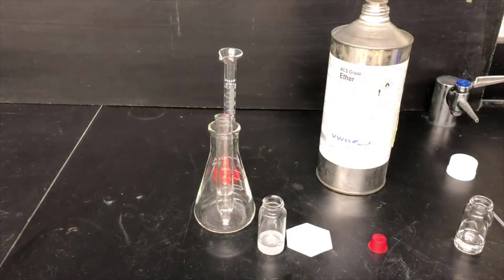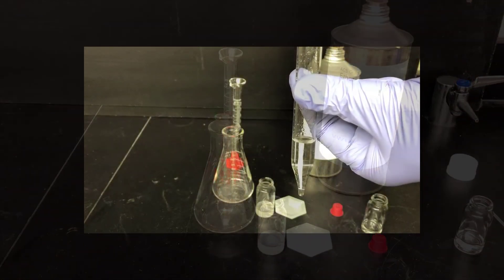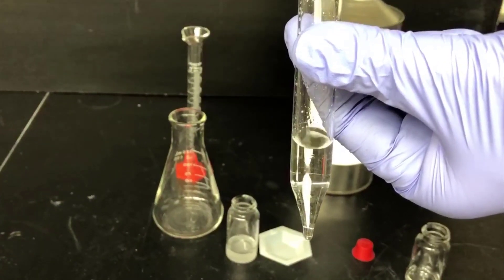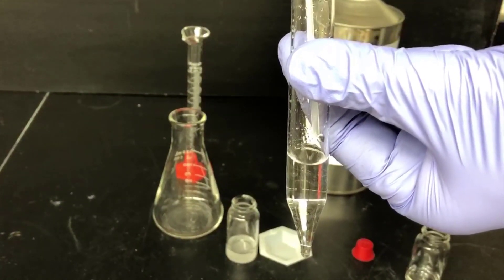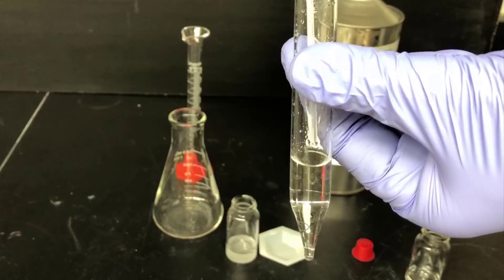Now that we have the top and bottom layer separated, we need to determine which one is the organic layer and which is the water layer. I'll test that using a water droplet test. I'm adding droplets of water to the upper layer to see what happens, to see where they go.